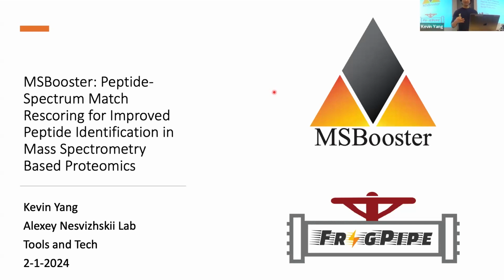I'm really excited to present at Tools and Tech about my tool called MSBooster, which is a tool for improved peptide identification and mass spectrometry-based proteomics.